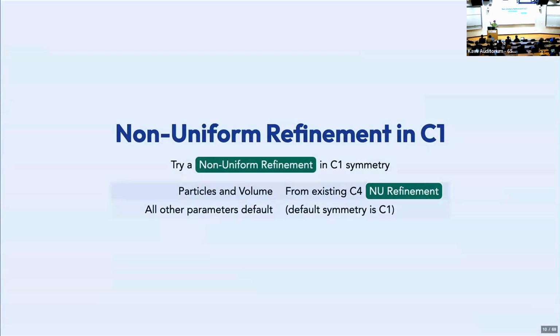It's nice that we have this big domain, because it's really obvious whether something works or doesn't. I'm going to talk about techniques you can use for samples that are a little more challenging, where maybe you can't just start from C1 from the beginning. And the next case study that Michael presents will go into even more detail about other kinds of symmetry. So one thing you might try is, well, we have the C4 symmetric map.